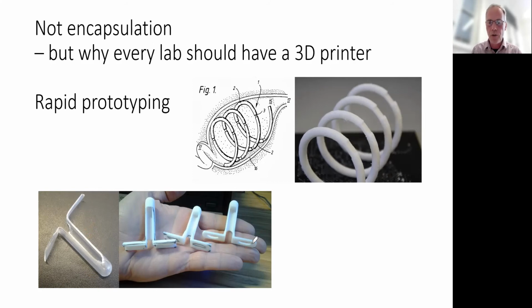And if we'd gone through a conventional manufacturing process to get to this point, rather than 4 hours, 5 hours, it would have been 4 or 5 weeks and tens of thousands of dollars. This is time and $2 worth of polymer.